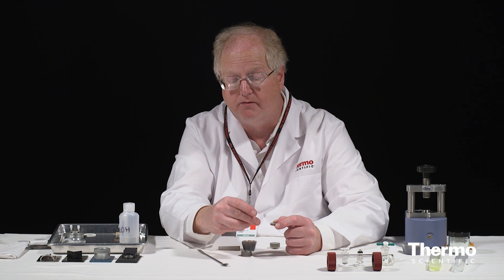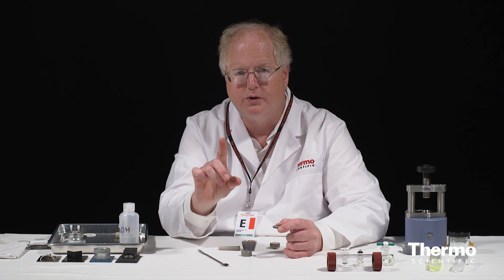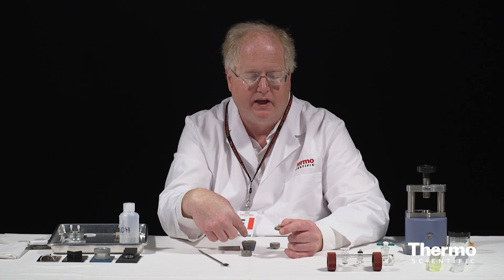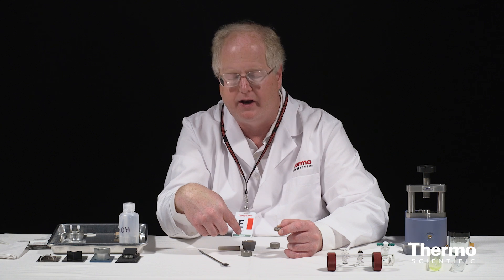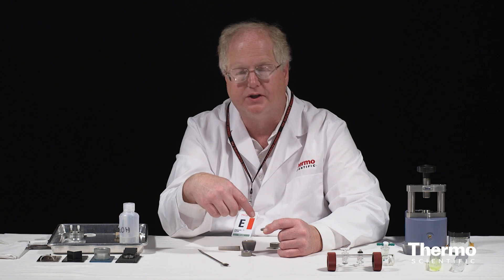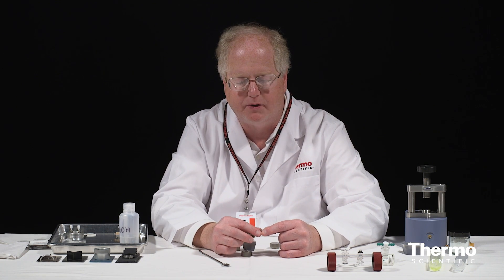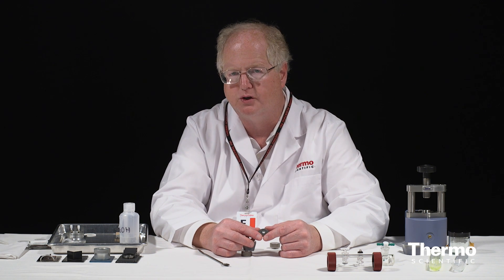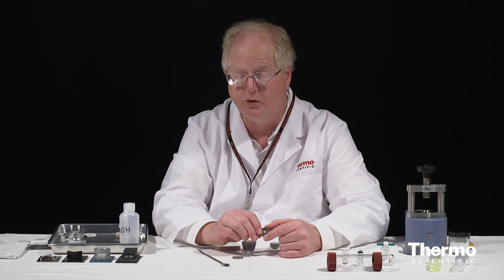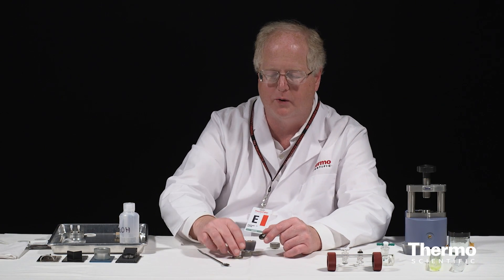So that's the process of making a pellet. The key points: don't over-concentrate the powder, and add just a little bit of your sample. It's always easy — if you run it and you see that you don't have enough sample, just take the crystal out, pop it out, make another sample, grind it up again and add some more sample. But if you add too much, your absorption's going to be too strong. That's usually the problem — having too little usually doesn't happen.